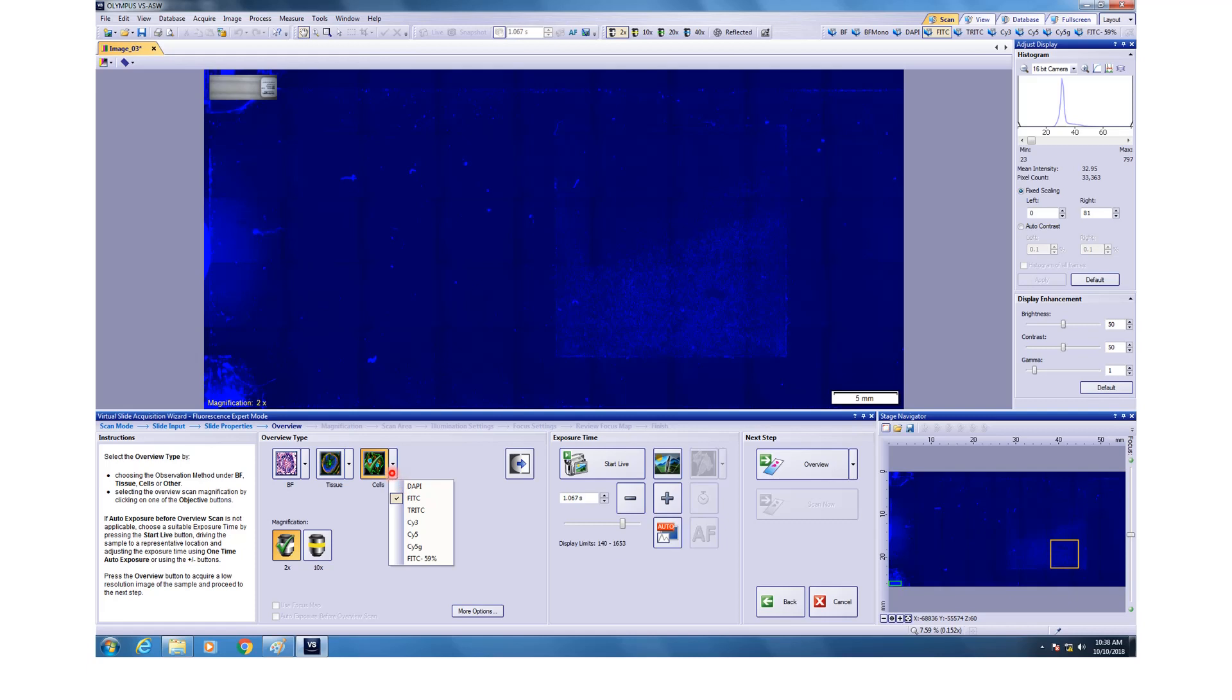And by clicking on this button here, you can get a drop down menu on which channel would you like to get the overview of. For example, this overview was done in DAPI channel. You can also do in the FITC channel or TRITC or any other channel. After this, you click overview.